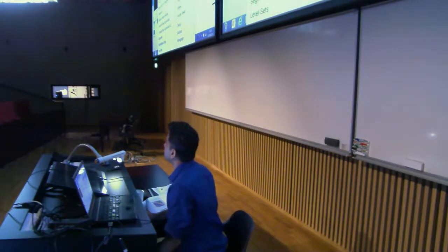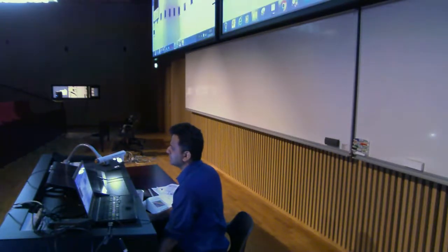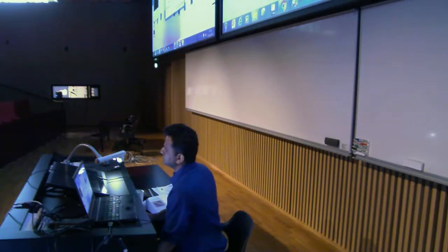Yes, go ahead. Can you comment a little bit more about the options that you can choose when you say set measurements? So for example, if I have done this analyze particles and I want to see how bright the individual particles are, would you advise to go for mean intensity or median intensity? What are the benefits or pitfalls? Yeah, exactly. So for the bright object, of course, in brief, I would go for maximum intensities.